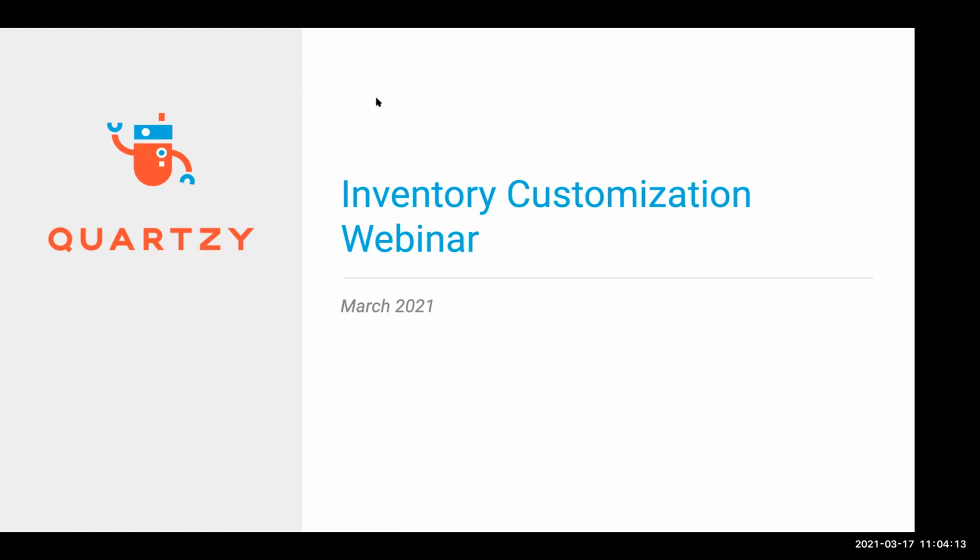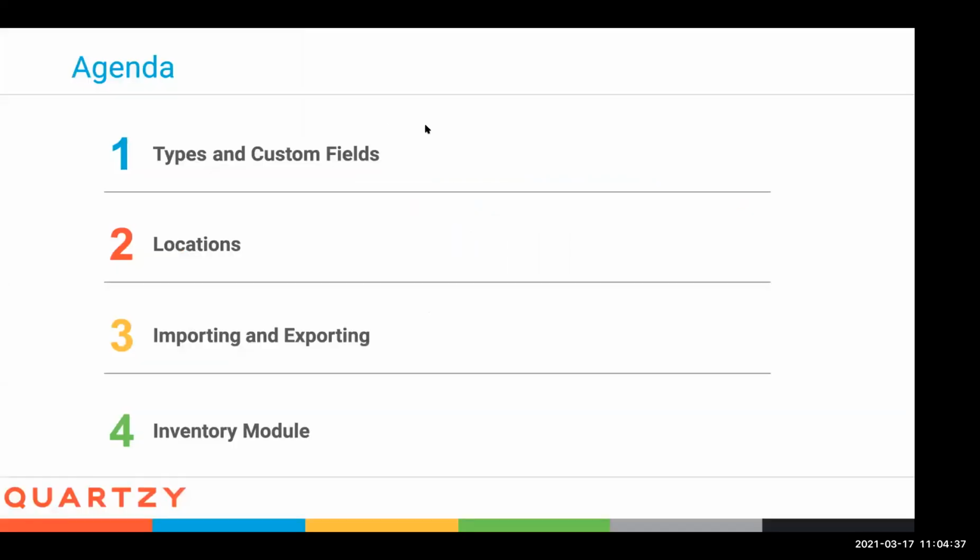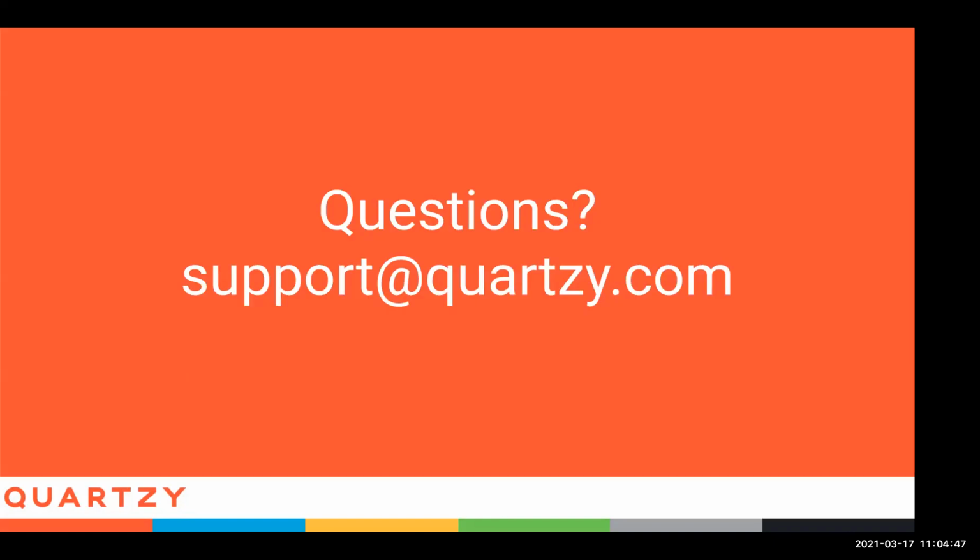Thank you so much for coming today, guys. I hope that all the information we share today will help you get the most out of all of our inventory features here. We'll go for about 30 minutes, and we'll have plenty of time for questions. If you do have a question during our demo, you can type it into the chat feature, and then Emily will take those questions and we'll stop periodically to answer them. We'll go over inventory types and custom fields, locations, importing and exporting, as well as how to customize the display of your inventory module. As always, if you have any questions, you can email us at support@quartzy.com.